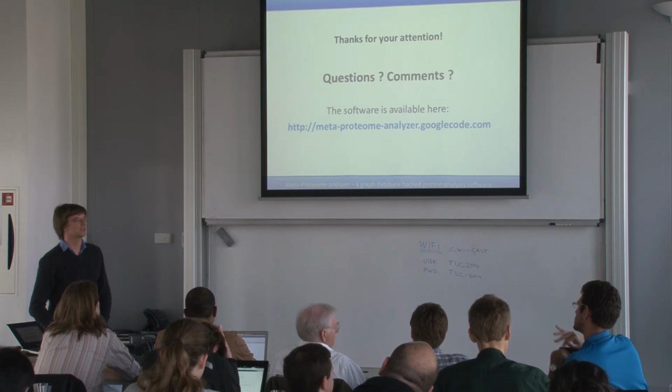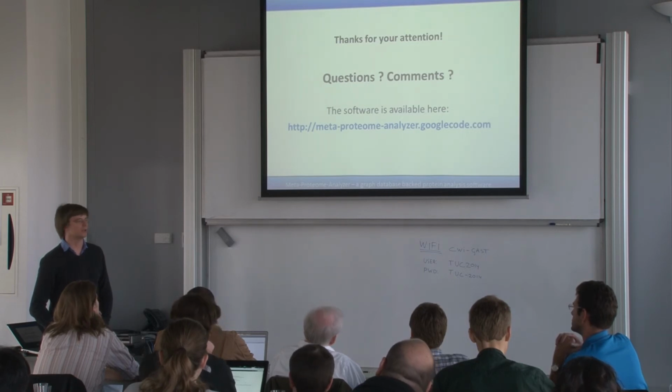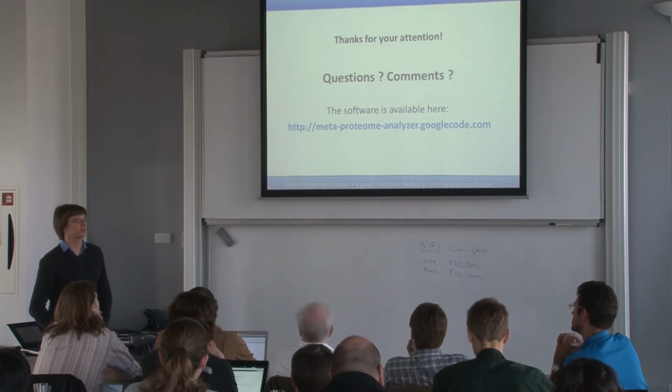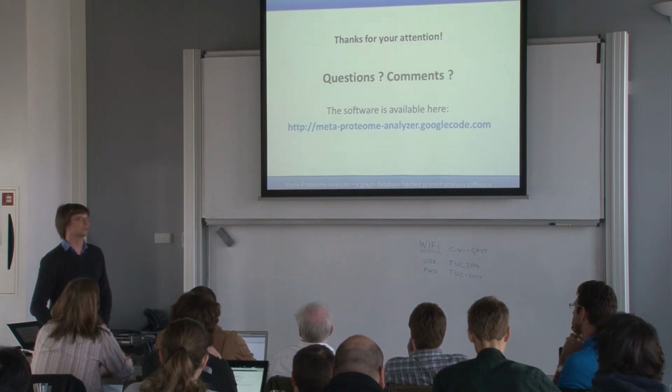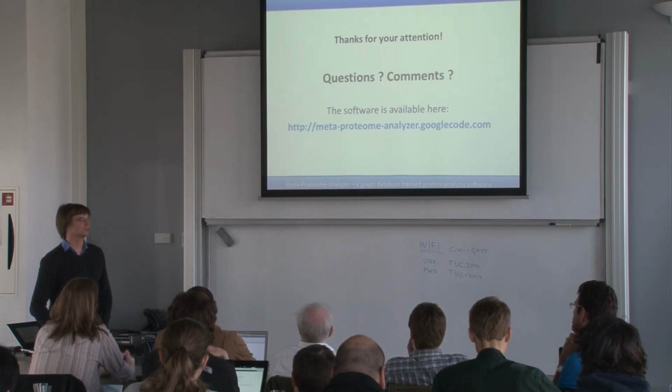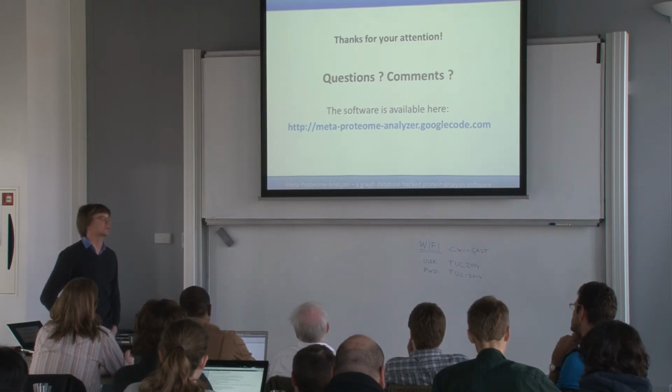Okay, so currently you just do wget to uniprot.org. Yeah. Input API and KEGG pathways and so on. How do you deal with the academic license and the issue? So we have it as Apache 2 license now. No, KEGG, the database. No, for KEGG we do not download the whole database, just query it after each run.